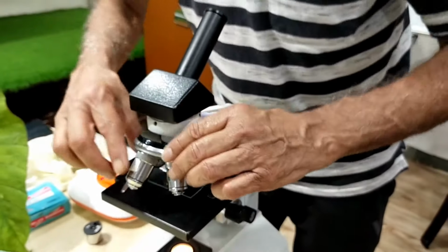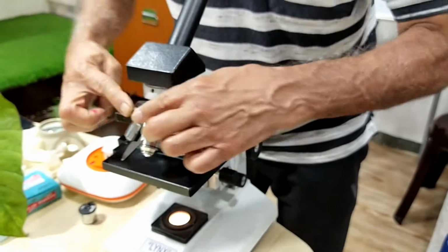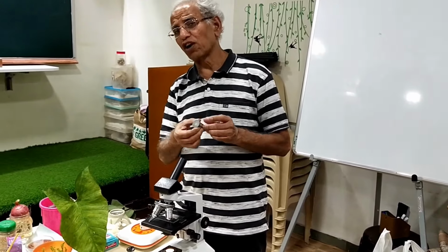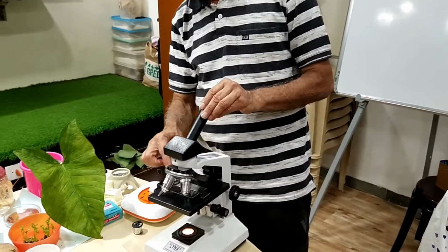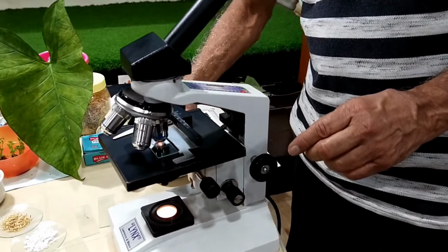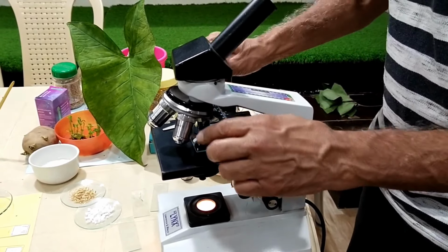So these are objective lenses. As you can see, I can move this. This is what is called the nose piece, and it can be moved. So the major parts are the eyepiece lens, which is called the ocular lens, and the objective lens, which is close to the object. This is a stage, and it can be moved. Can you see this? It can be moved. It's possible to fix the slide in this clip, and it can be moved.